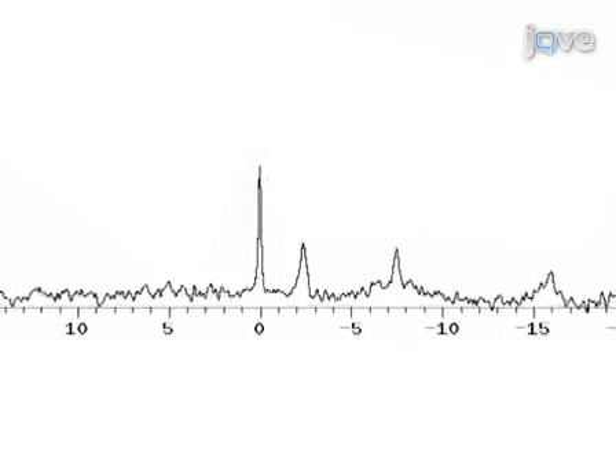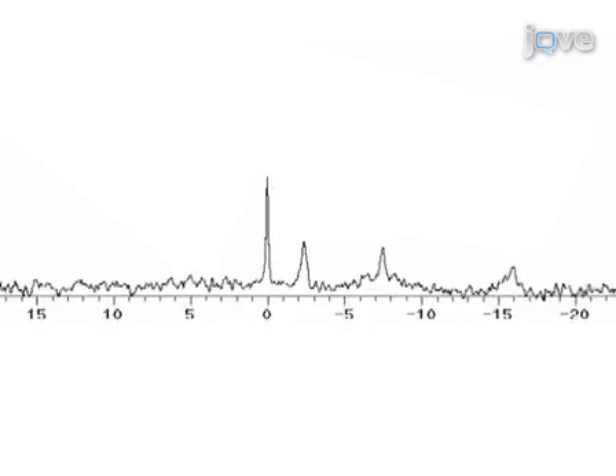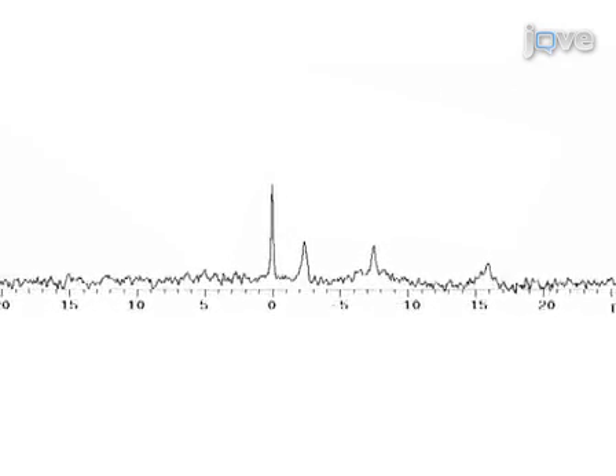Results were obtained that show cardiac function and energetics based on the LV pressure waves and P31 NMR spectroscopy.